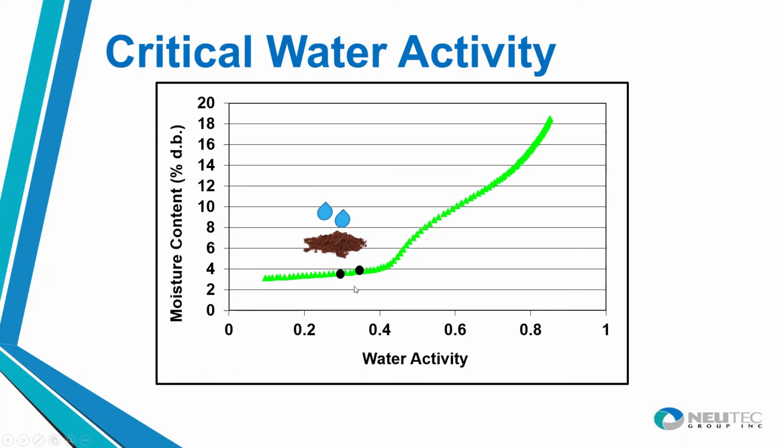What we find is that due to that exposure, eventually the water activity of the samples will move to values higher than that inflection point. And now you've got caked product, because that transition makes it much more susceptible to caking and clumping. So we can identify that inflection point as the critical water activity.